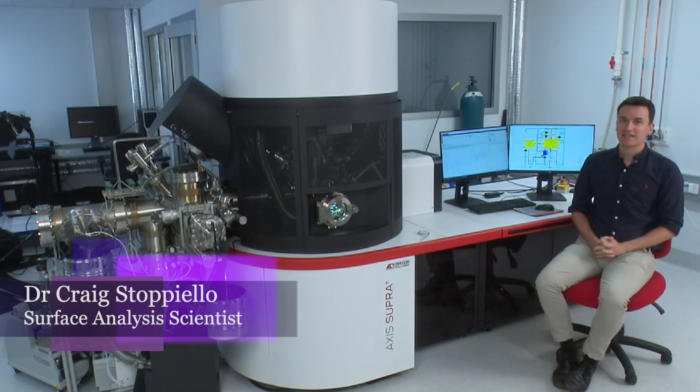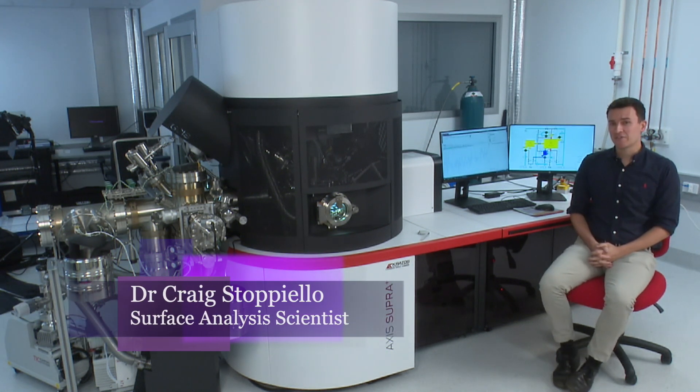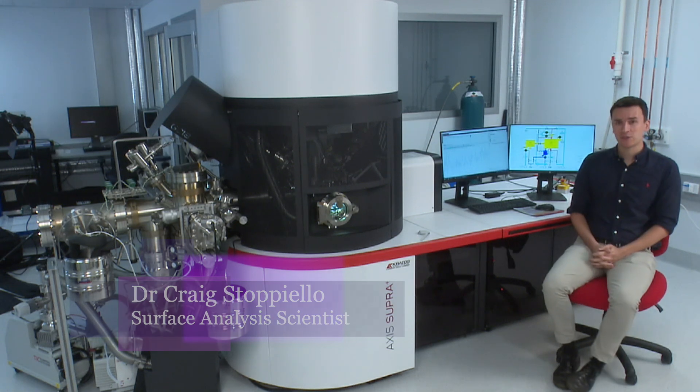This is the Kratos Axis Supra Plus XPS instrument. It has been at the University of Queensland since August 2021.